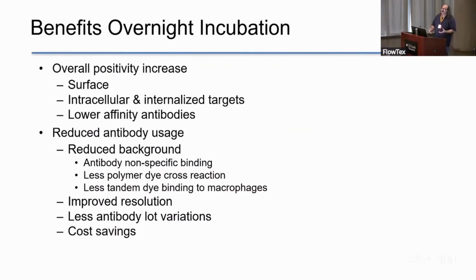So once again, I want to go over the benefits of the overnight incubation methodology. Once again, the surface, intracellular and internalized targets, you can see them a lot better. The low affinity antibodies, the ones that take forever to reach their maximum, are much better because you gave them enough time to get the job done. We have a drastic reduction in antibodies. Most of these were like a 1 to 10-fold decrease in antibody.